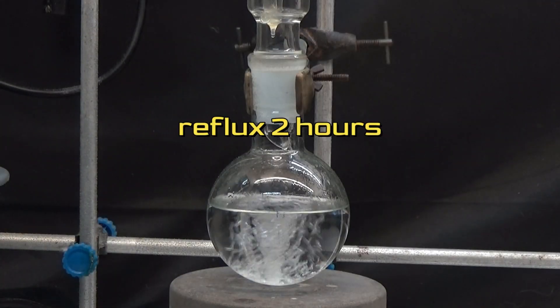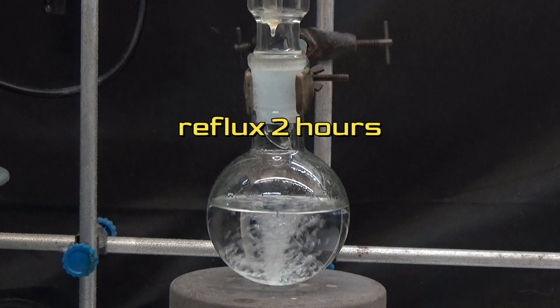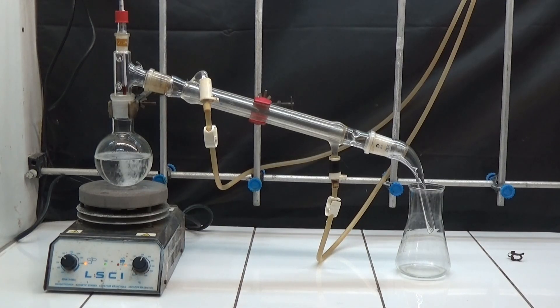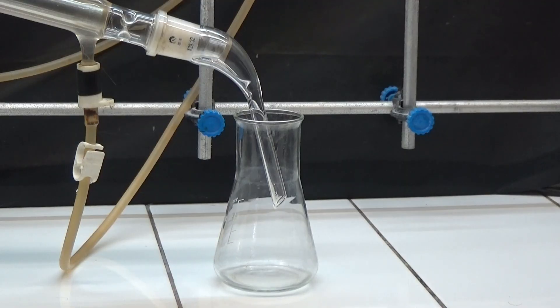For 2 hours, the mixture is heated at reflux. Once reflux is complete, set up distillation equipment and distill as much ethanol as possible under normal pressure.